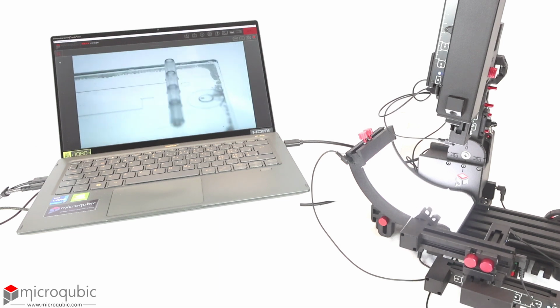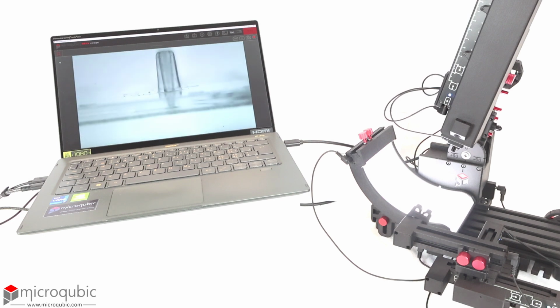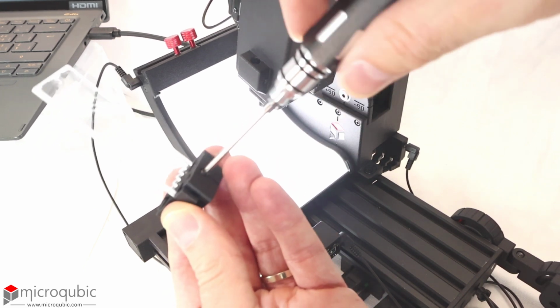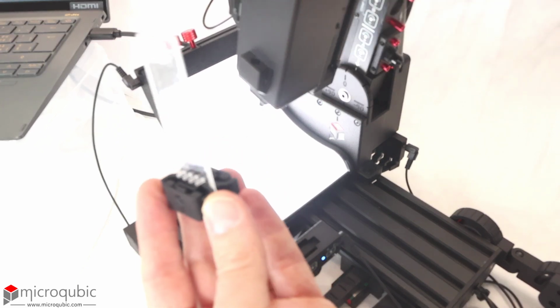Optionally, you can tilt the camera for optimal illumination and viewing direction. The clamping force of the holder can be adjusted using the provided screwdriver. Please get in touch with us for customized holders for your specific samples.